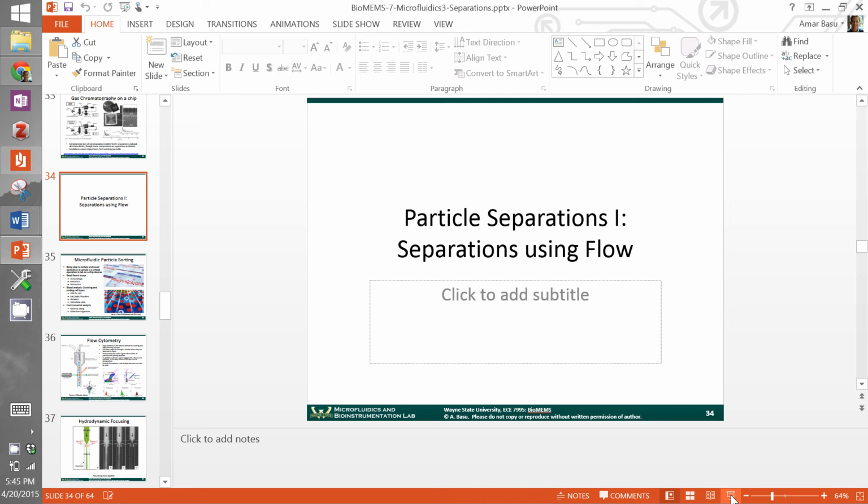So these are methods that were used to separate molecules based on the concept of diffusion, in the case of the H filter, on the basis of charge and size, if we're talking about electrophoresis. And if we're talking about chromatography, you can separate based on a whole bunch of different properties. Size could be one of them. Surface properties like hydrophobicity, hydrophilicity could be another one of them. Charge could be another one of them. Whatever you want to separate based on will determine the type of column that you purchase, HPLC column. You can purchase different ones for different reasons.